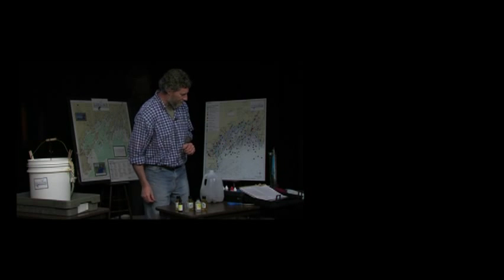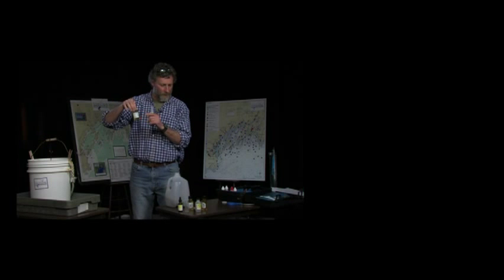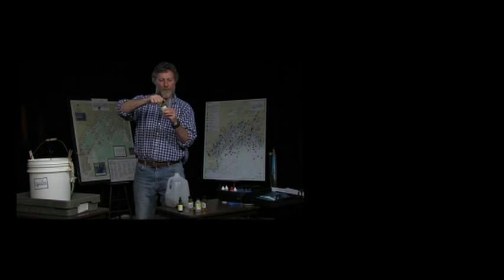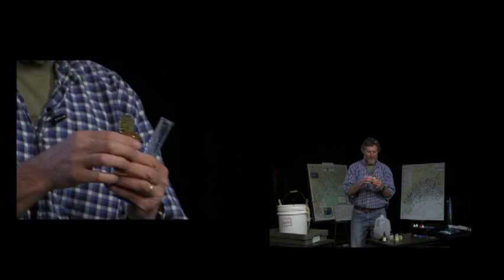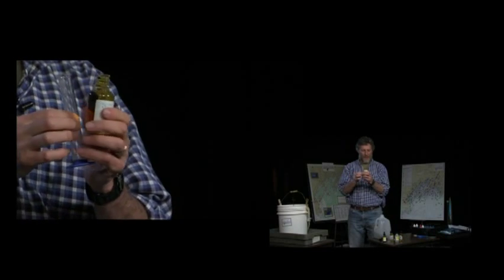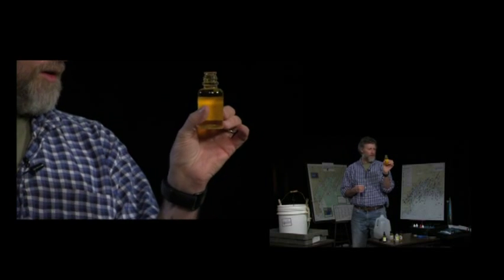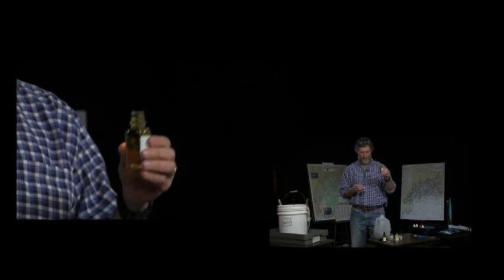The first thing that we're going to do is take bottle number 1, and we're going to go in that order: bottle 1, bottle 2, bottle 3. We need to pour 20 mils of this sample water in order to do our titration. This is about a 60 mil bottle, so we've got plenty of extra to use.